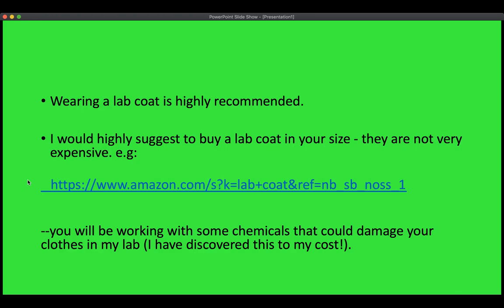Second one, this is not a rule, by the way. This is a recommendation. Thinking that you are going to continue college, you are going to continue taking chemistry or science courses, for some of the courses you are going to need lab coats, okay? So, this being a very introductory chemistry lab course, I want to be the first one to tell you that some instructors slash professors will require you to wear lab coats. And I don't want that to come as a surprise for you when you take other classes.